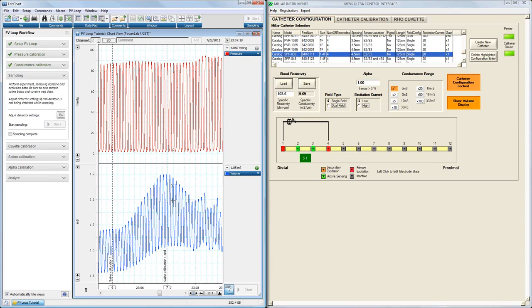From its behavior and how it compares to the unity line of end-systolic and diastolic volume, we look for a parallel conductance volume that we can subtract from the volume values to remove any influence of the heart tissue from the actual volume calibration.